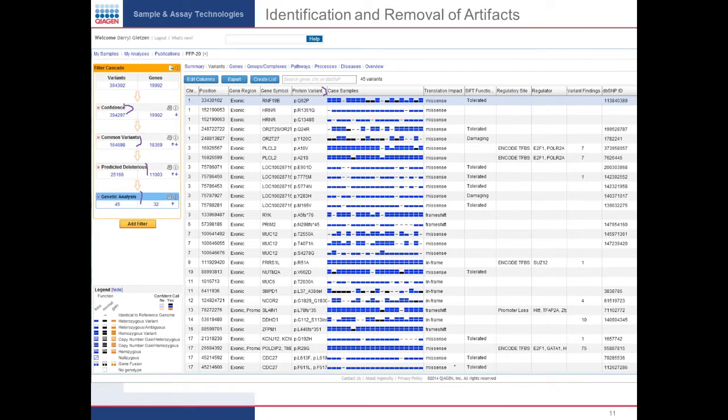These are my PGP samples. These are my controls. And you can see it's just littered with what look to me like artifacts, because I've already filtered against 1,000 Genomes, Complete Genomics genomes, and the Exome Sequencing Project. So there's nothing here indicated to be in the population more than 3%. But obviously, in my study, it's 40, 50, 80%, whatever. Let me jump away from this.